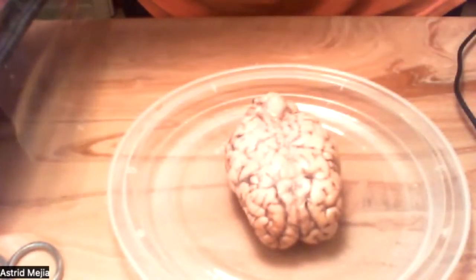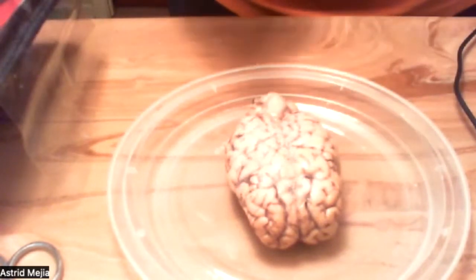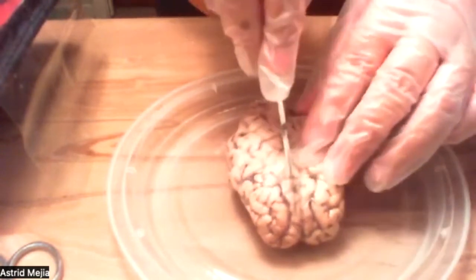Okay, from here, now we're actually going to get to the dissection part. And for that, we're going to cut it in the middle.